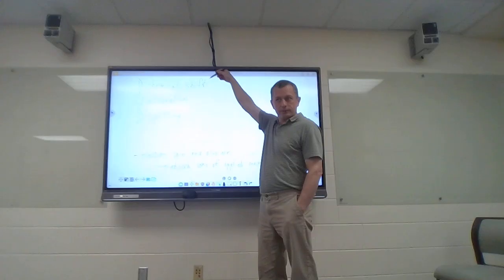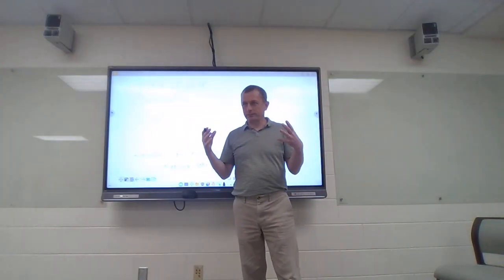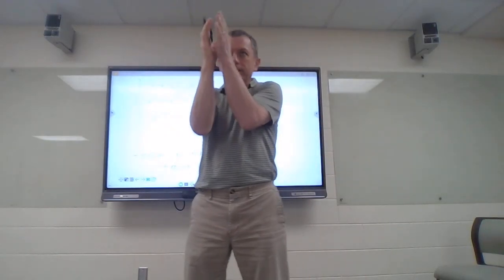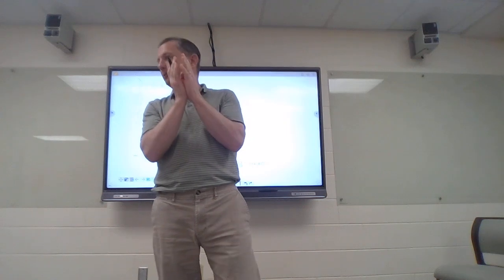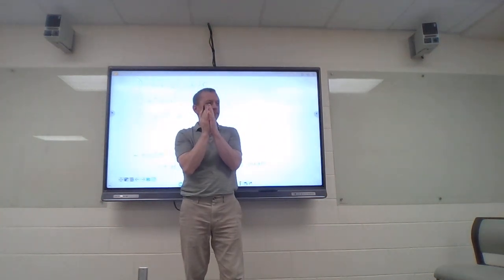Chemical shift is that effect from the electrons. All right? So chemical shift literally is kind of saying, what is the frequency of a nuclei? The exact frequency. I can't even tell you how many decimal places, but the exact frequency of the nuclei that I'm looking at. Okay?